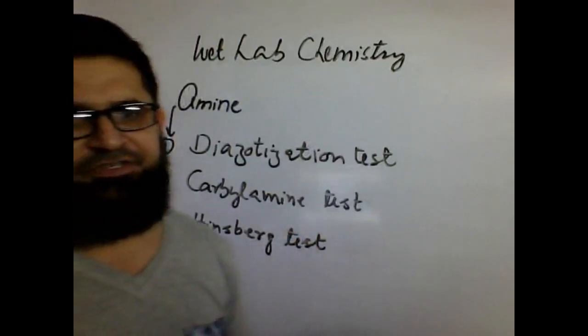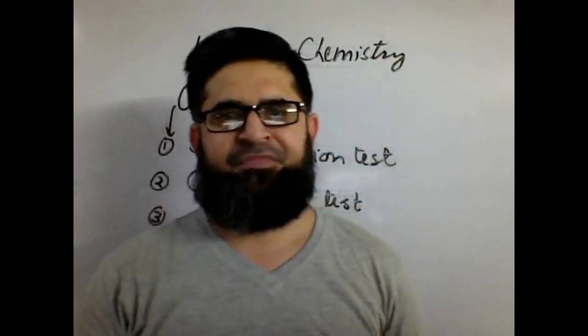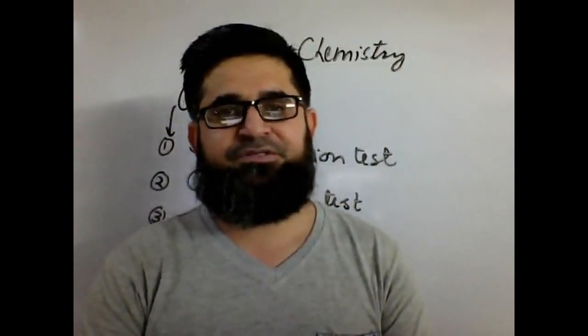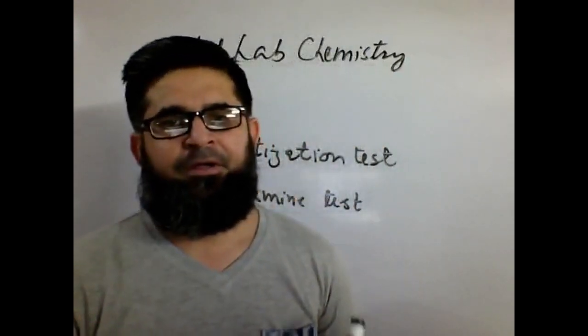These were the tests which help you identify the given unknown compound if it is an amine, basic in nature, and the line of action was determined by the litmus solution test.